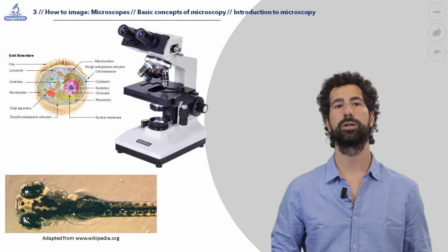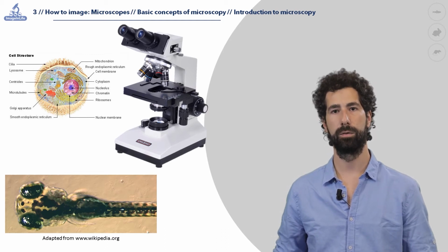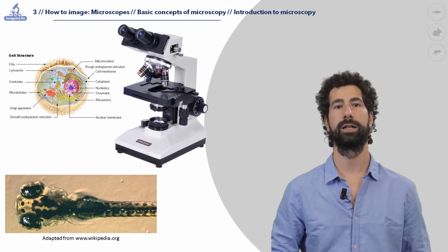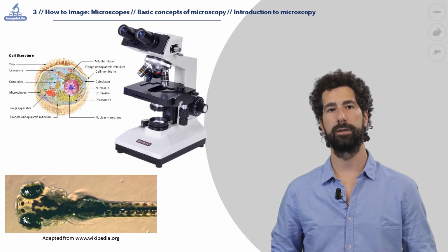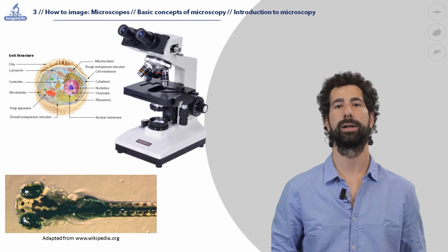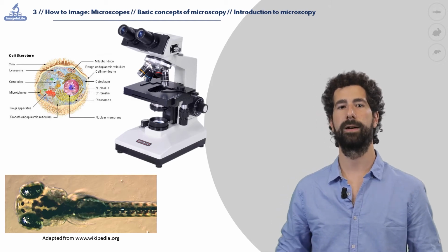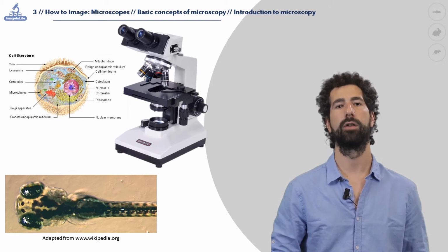Particularly, we want to describe its application in biological study, in which the sample of interest are cells, tissue, or even entire organisms and their biological processes that have been introduced in previous lectures. As there is a big variety of microscopy techniques, it is important to understand which microscope will give better result for a particular biological application. To do that, let's first define some basic parameters that will help in understanding the performance of a microscope.